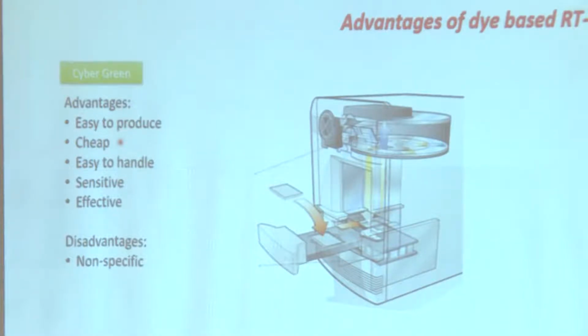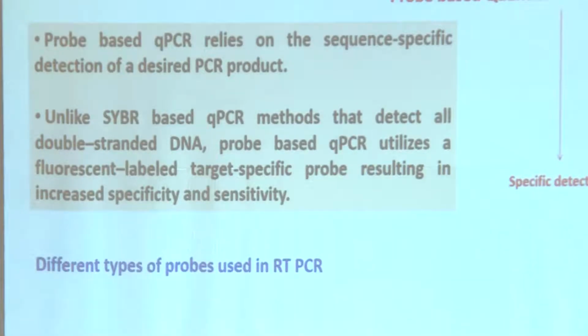That is what in the previous slides I told. The dye based real time PCR is not specific. This is clear to all of you, all the students. Anybody is having any doubts, I can repeat. Now, we will move on to the probe based quantitative real time PCR.